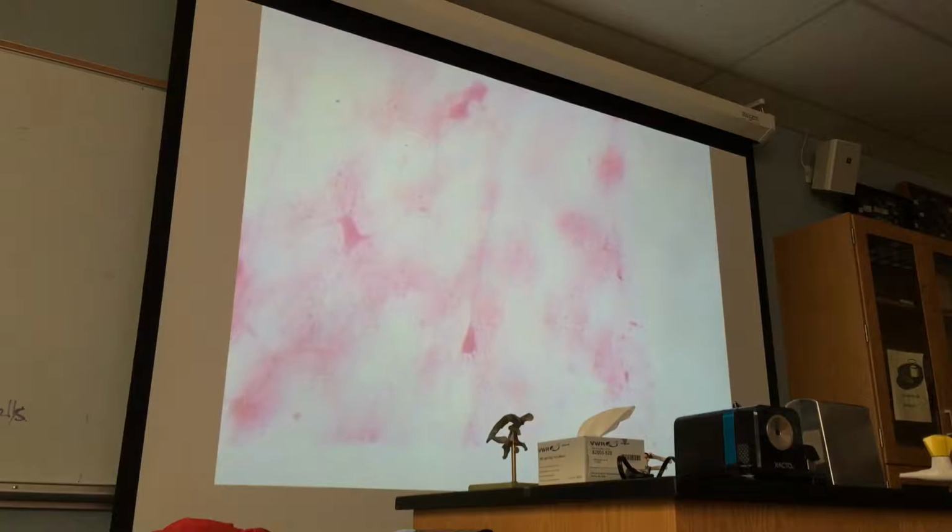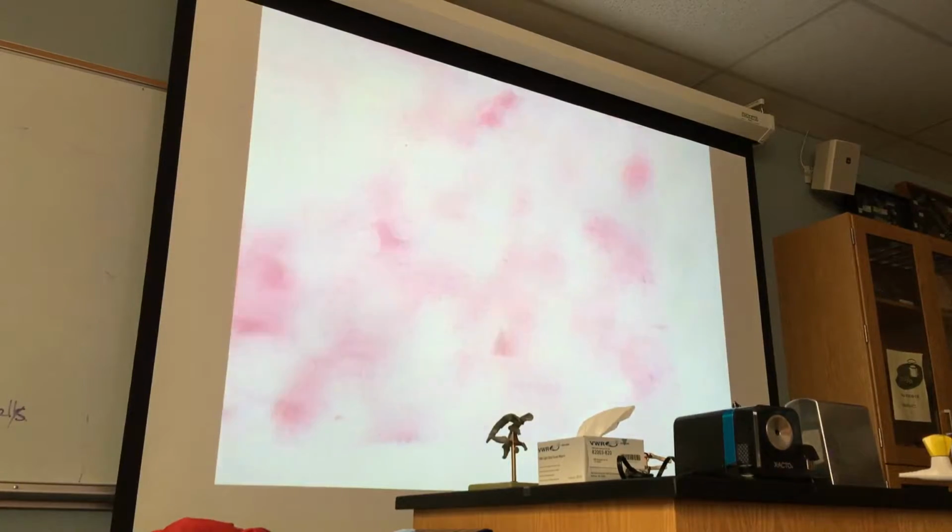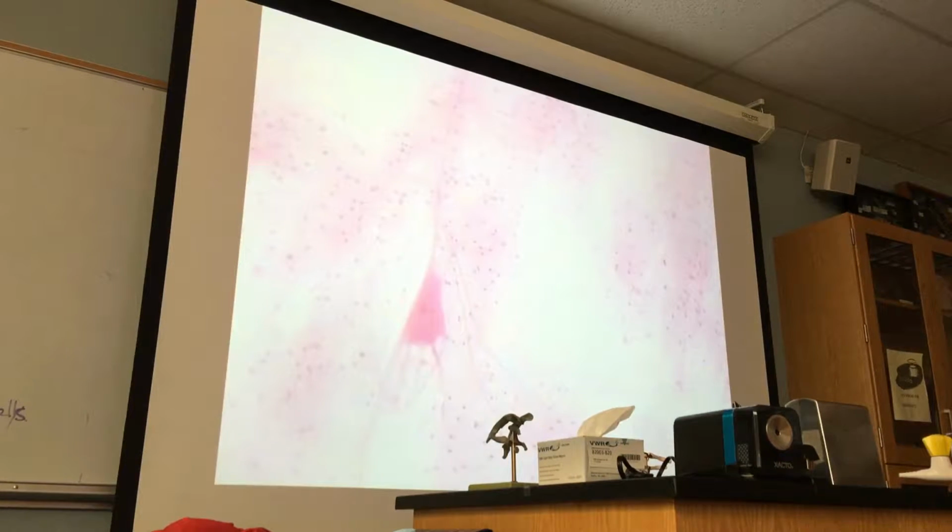Can you see neurons, multiple neurons and neuroglial cells in this magnification? We went over this. Let us go for higher magnification. You see clearly the cell body. Inside the cell body, cytoplasm and the nucleus. From the cell body or the soma, see the dendrites.